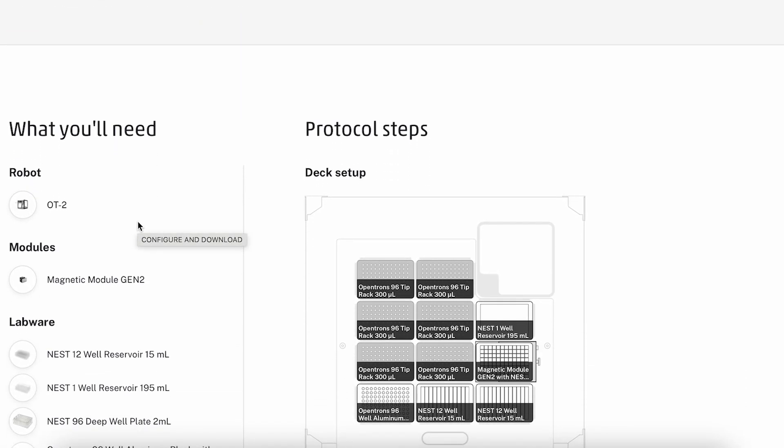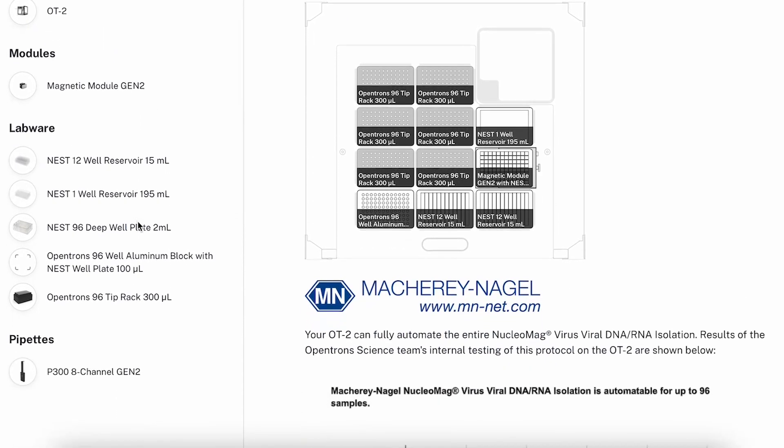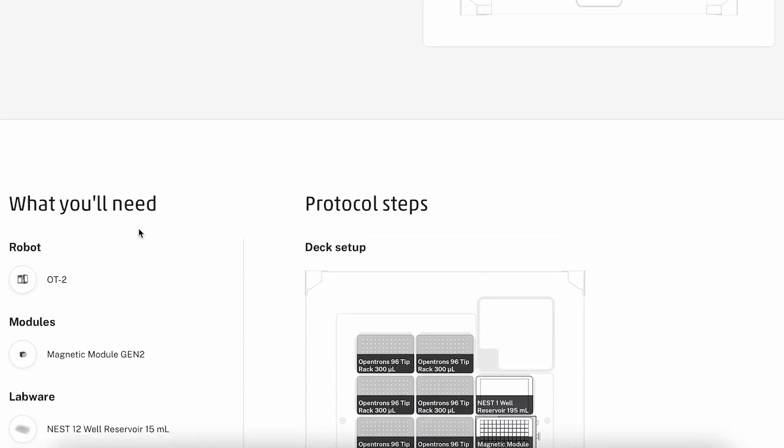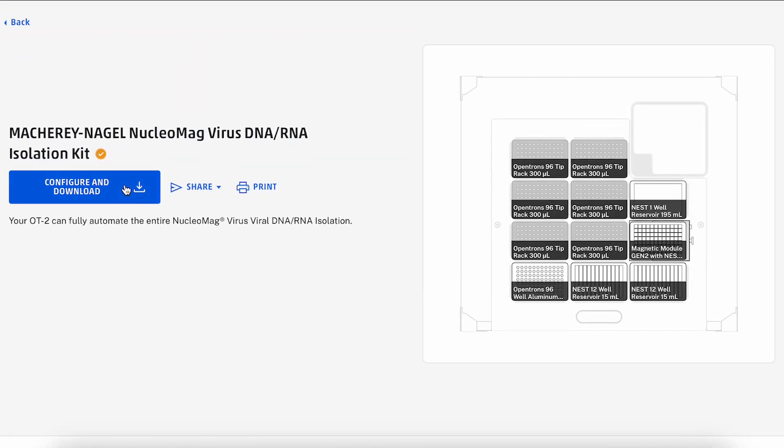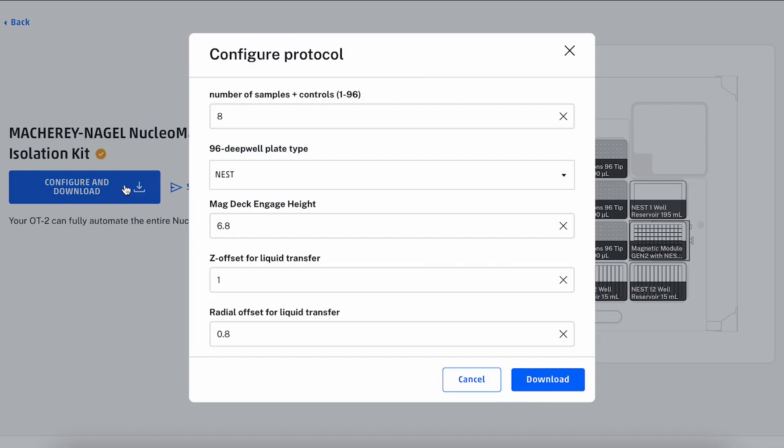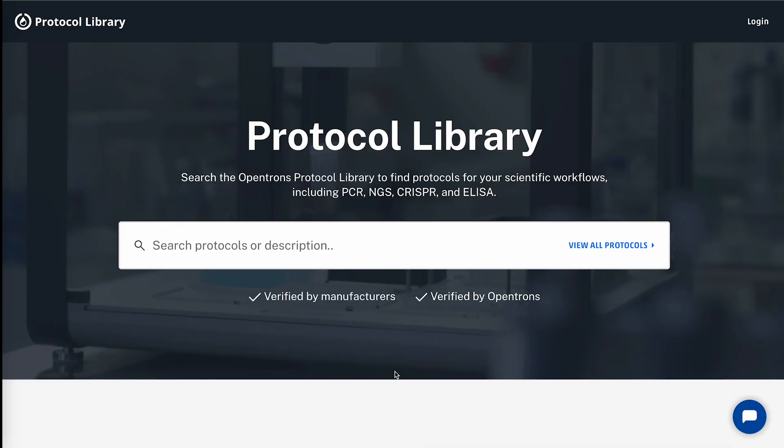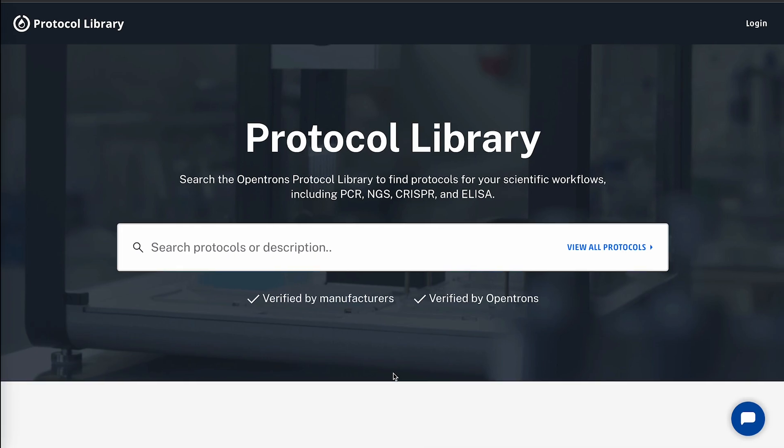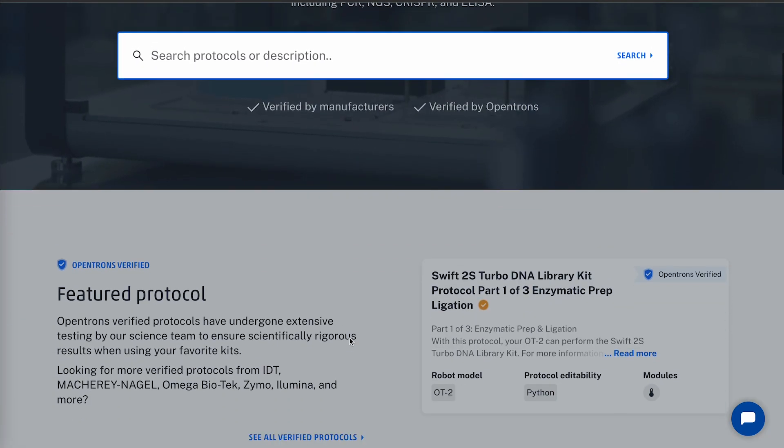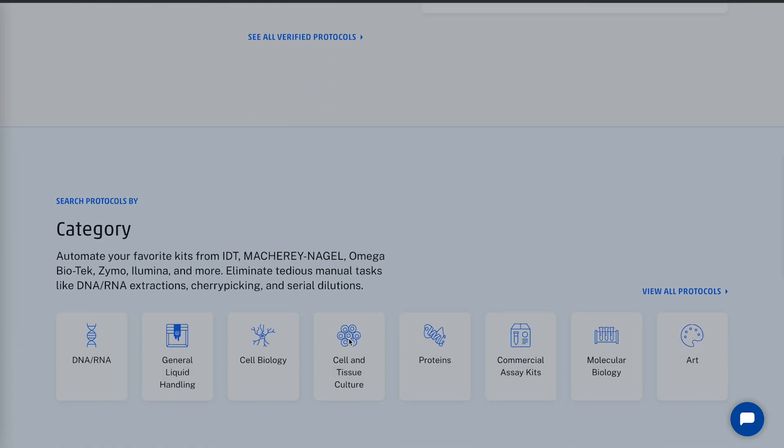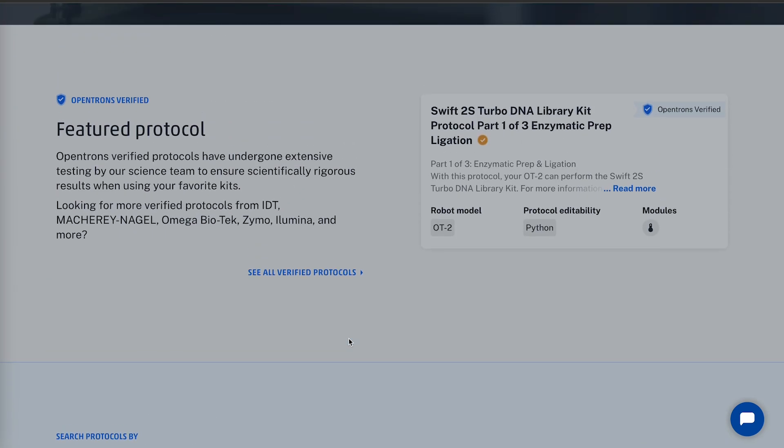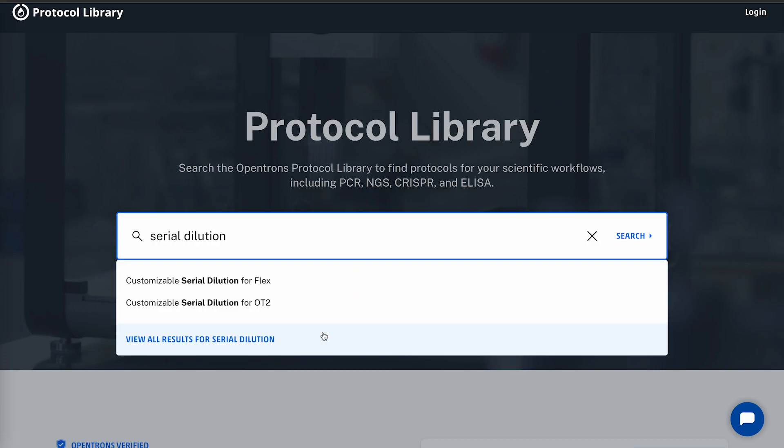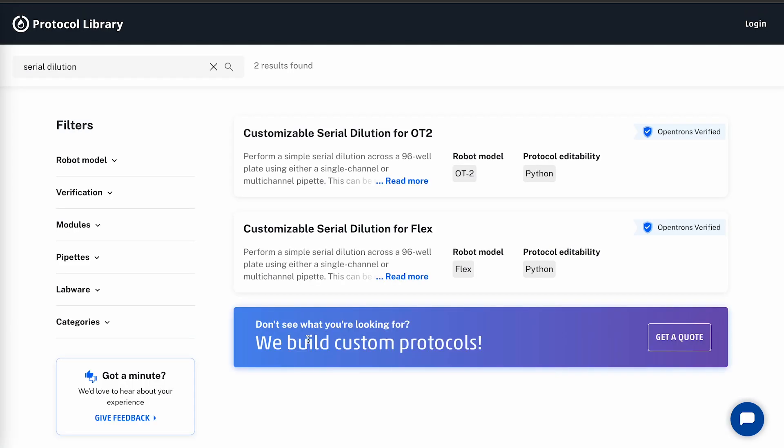Additionally, we have numerous verified protocols that have been tested by our in-house science team or reagent manufacturers. To find a protocol that fits my needs, we can either use the search bar to search for one or we can browse for one based on the category of our application. Since I need a simple serial dilution for my wonderful new Flex, I'll use the search bar to search for that protocol.